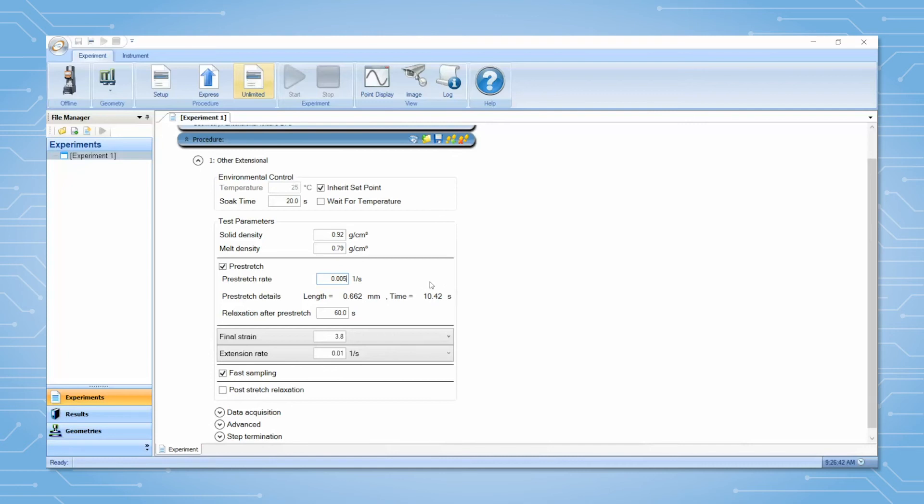The relaxation after pre-stretch time should be set so the sample relaxes fully before the extensional experiment starts. Less than 30 seconds is typical. Set the desired final strain or time and the desired extensional rate.